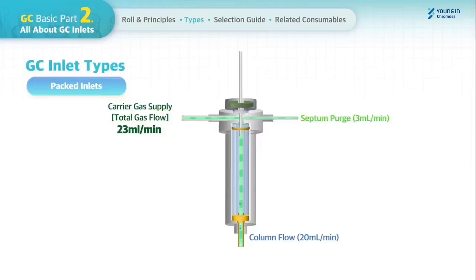Depending on the GC manufacturers, the usage of the septum purge line could be not available.